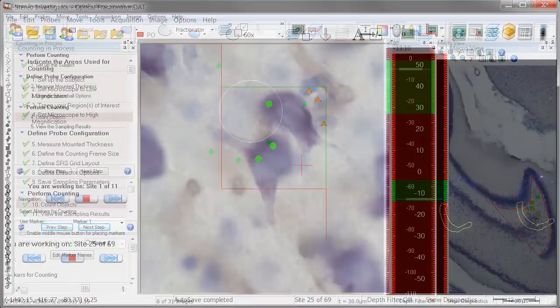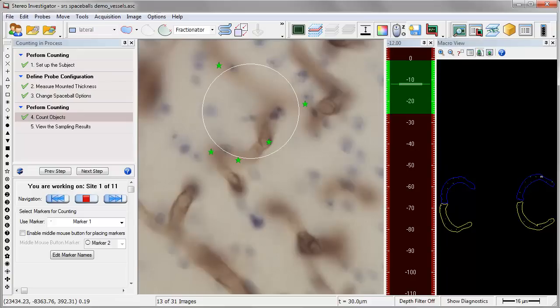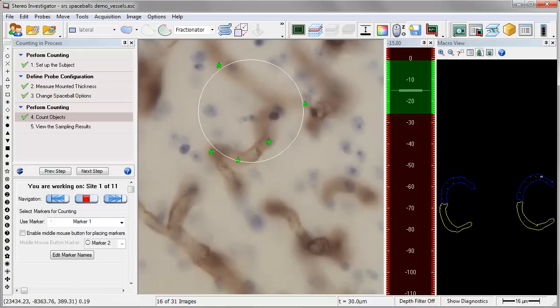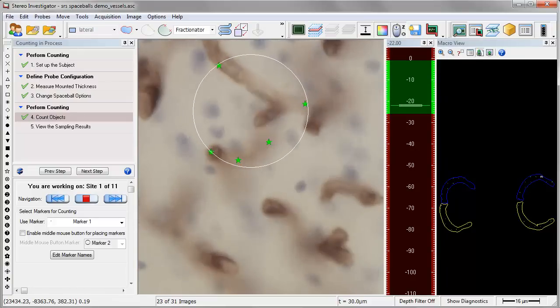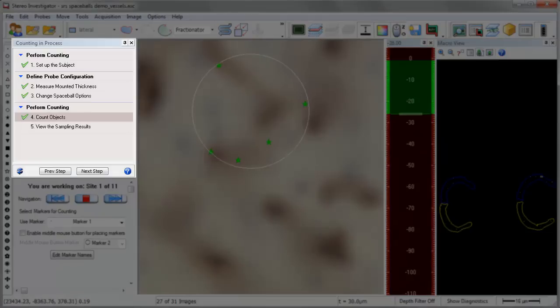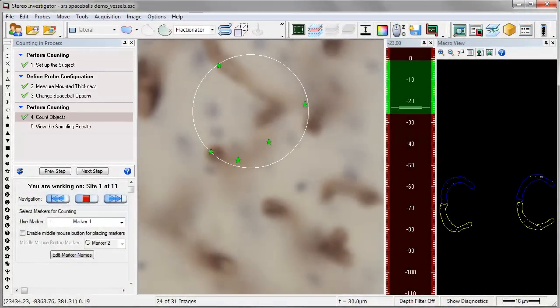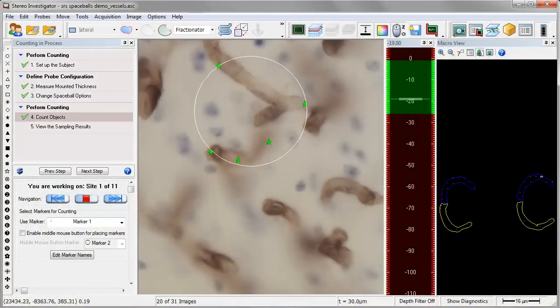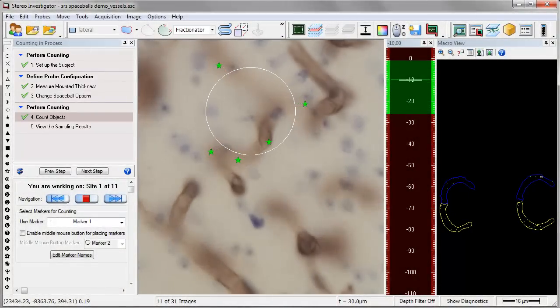Spaceballs is a stereological probe used to estimate total length and length density of fibers, such as dendritic branches or capillaries in any region. It is also designed with a workflow to streamline your throughput and ensure you accurately perform the stereological method.